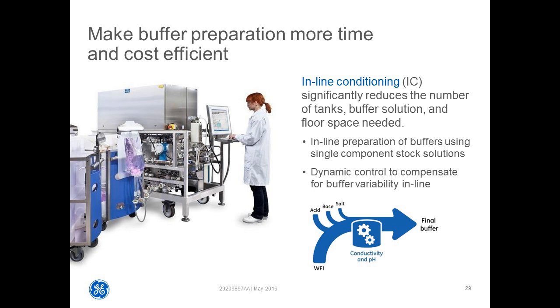A lot of us are familiar with the pain points associated with buffer formulation and handling. Especially as you go up in scale, buffer preparation necessitates large tank farms, preparing these buffers ahead of time, and moving them through facilities in a cumbersome manner. So how do you make that process more intensified and more intelligent? Inline conditioning is a way of solving that problem.